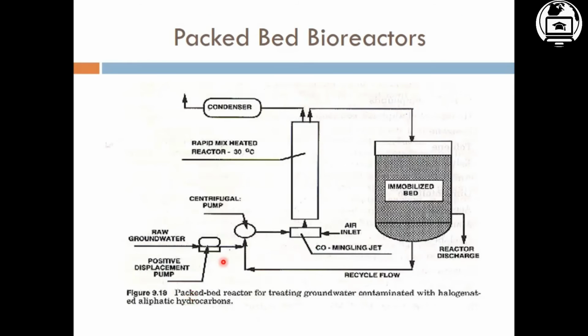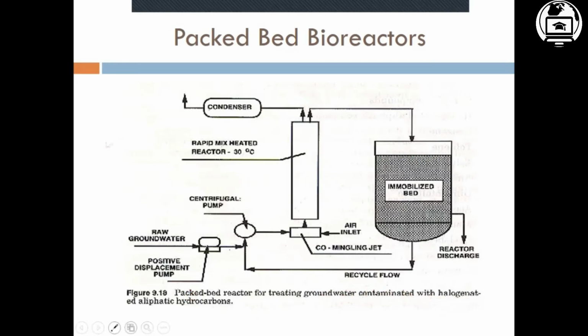So here is the packed bed reactor for treating groundwater contaminated with halogenated aliphatic hydrocarbons.